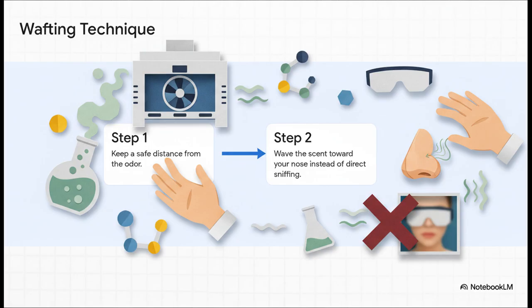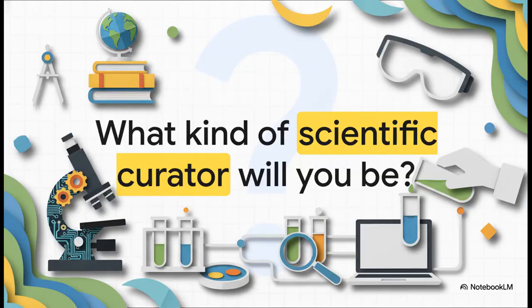You have got to break this down and teach it as a tangible, physical technique to your students before they ever uncap a single test tube. So, we've covered a lot today. The developmental appropriateness of tools for both primary and upper grades, the seamless integration of modern technology, and the relentless, active modeling of safety techniques.